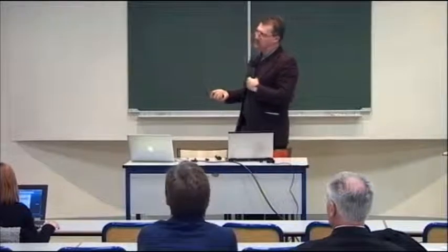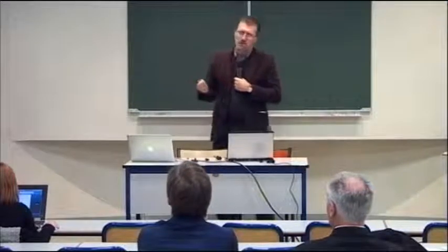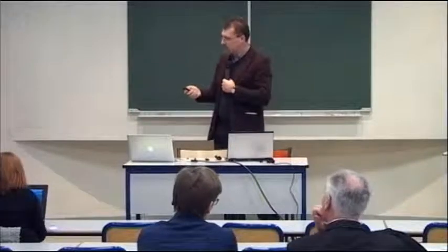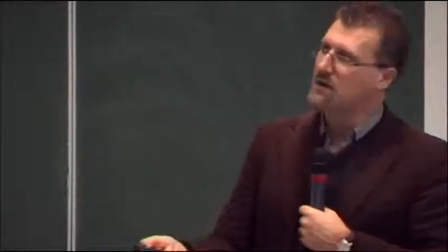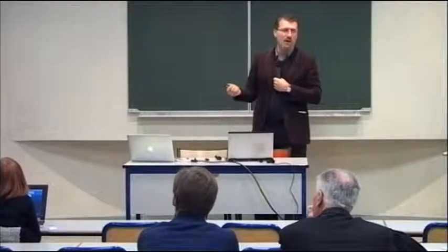And before I go into a few possible applications, I want to bring up two other things. First of all, these fibers, again, as polymers are, they are semi-flexible. So I showed you this information is accessible through small angle neutron scattering. You see a change in the fractal exponent. But if you do microscopy, it's exactly the same thing, but you do everything in 2D.